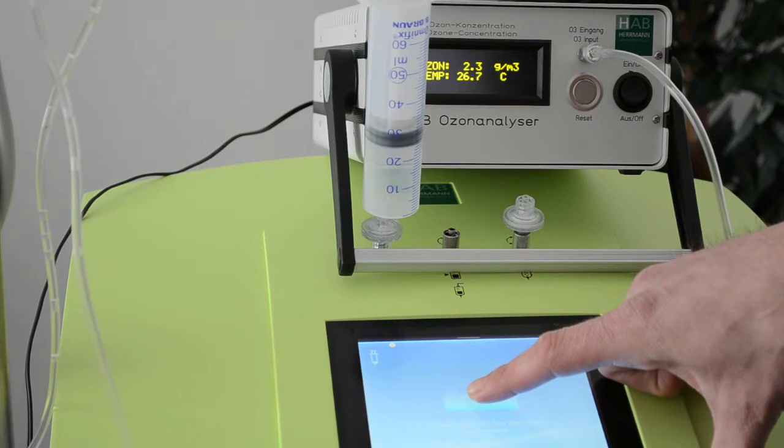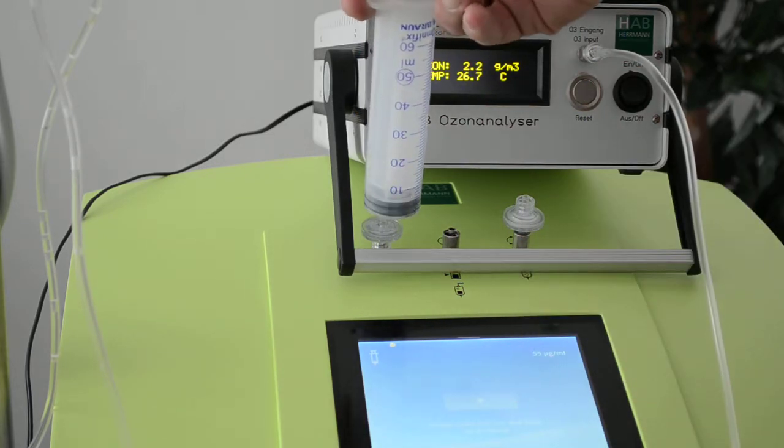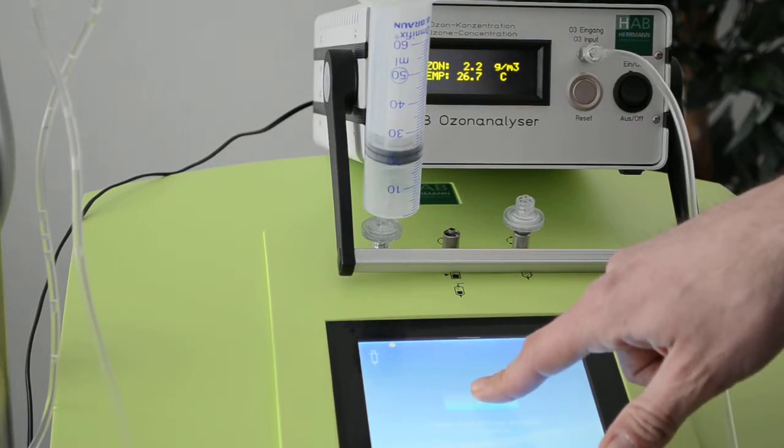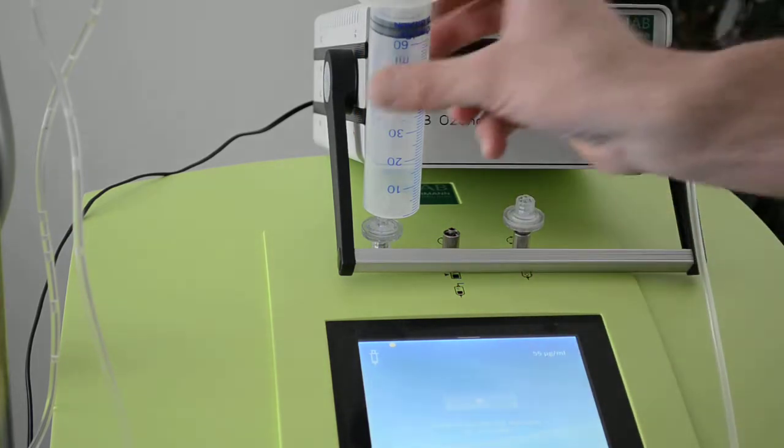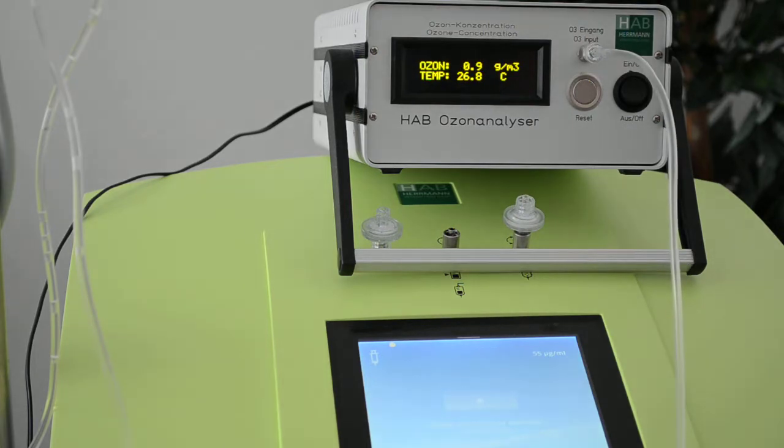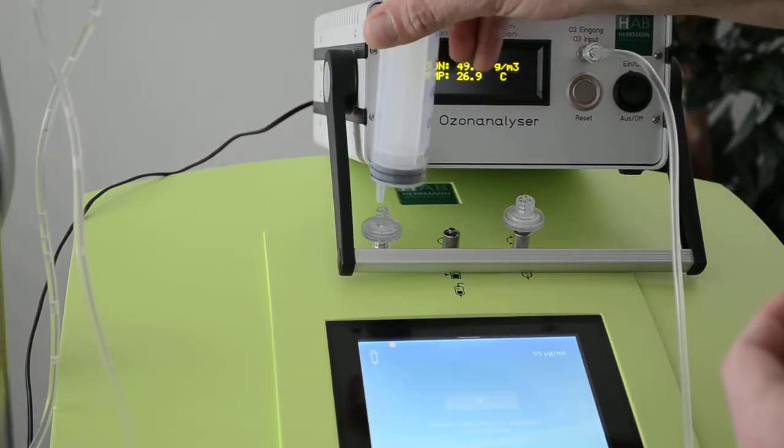The first time we will flush it as described in our manual. Then I fill the syringe a second time. Let's fill it completely. Then I take it away, add it here, and press it into the analyzer. 54.3. We can do it again.